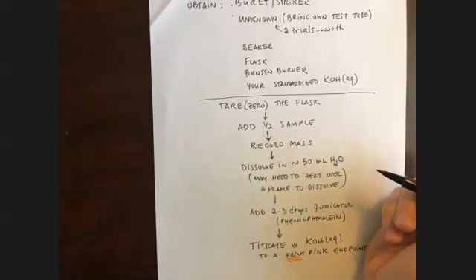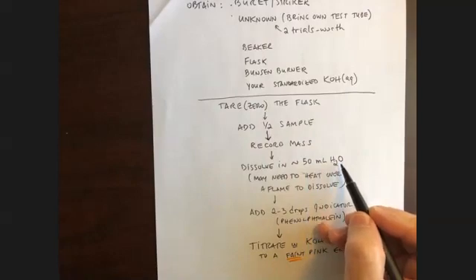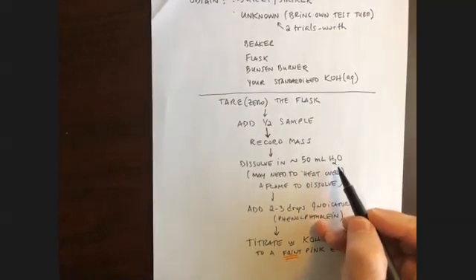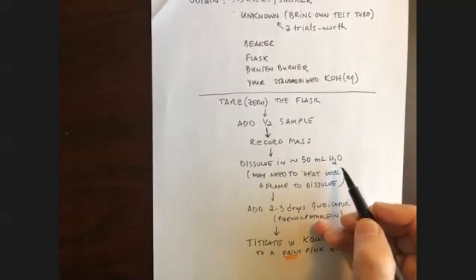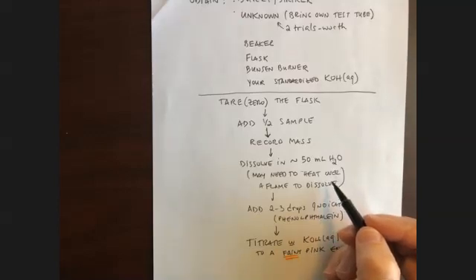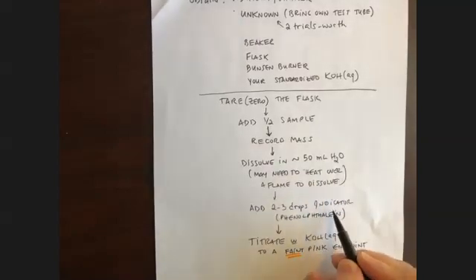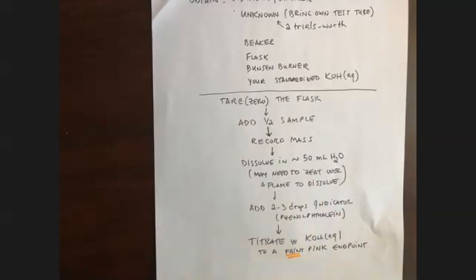Then, of course, since we're doing a titration, we're going to dissolve this in about 50 milliliters of water, obviously distilled water. And just like in the previous experiment, with the standard that you used, which was KHP, potassium hydrogen phthalate, you may need to heat over the flame in order to dissolve your unknown acid. So be careful with that. Do it carefully, do it gently. And once it dissolves, let it cool down back to room temperature before you add 2 or 3 drops of our indicator, which will be, again, phenolphthalein.